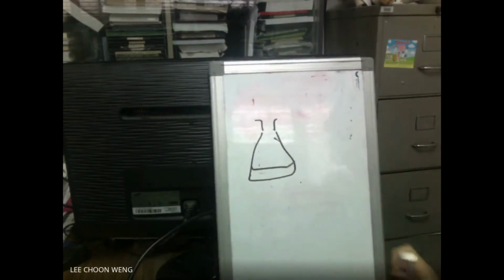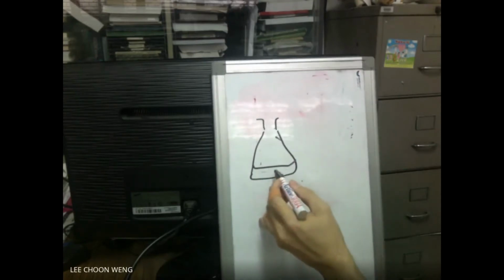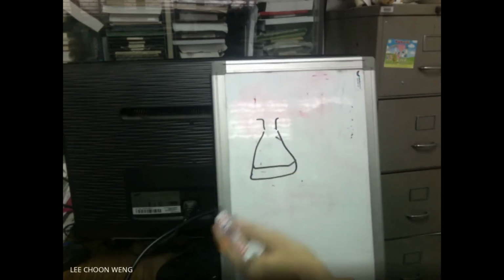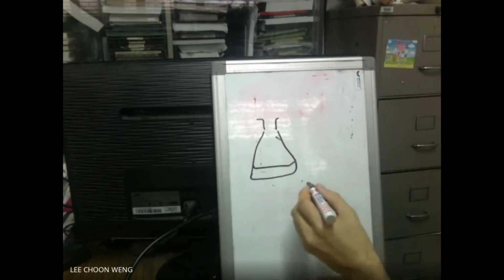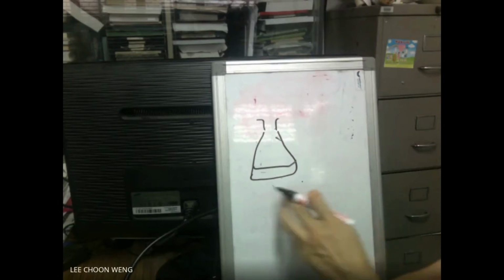If you notice, you are asked to place just a little bit of soil here, about 0.2 grams into 50 mils of solution.